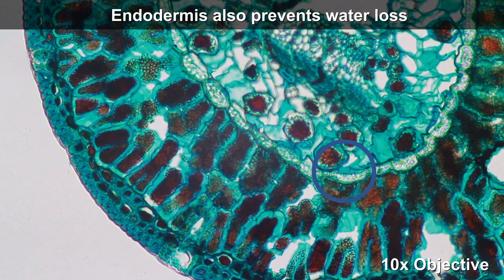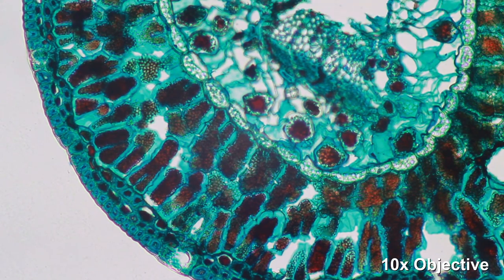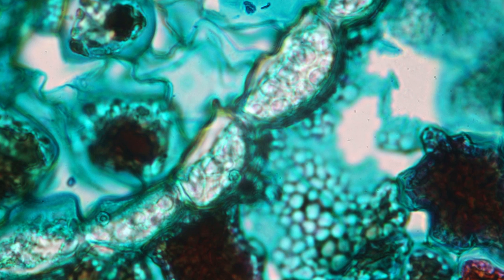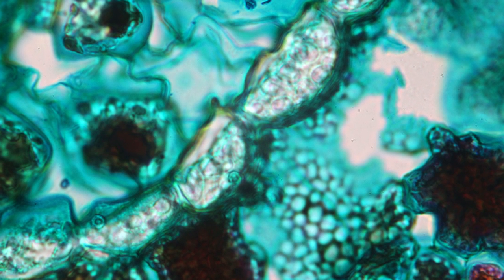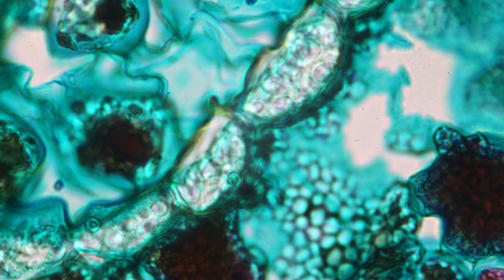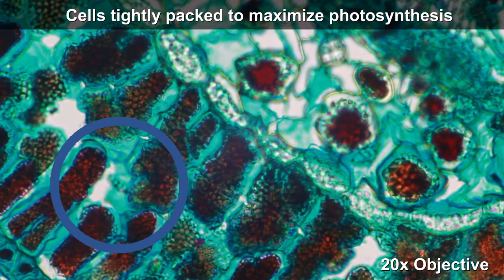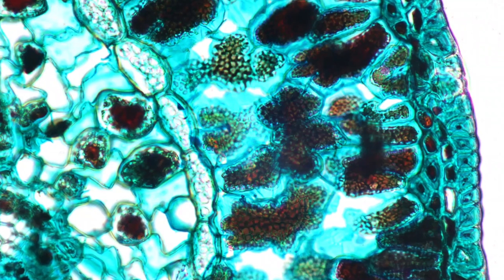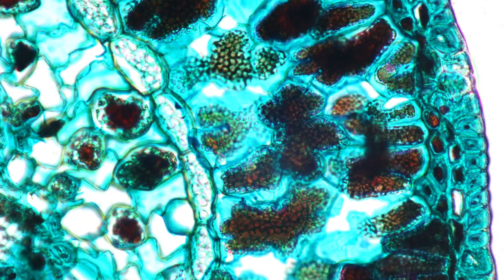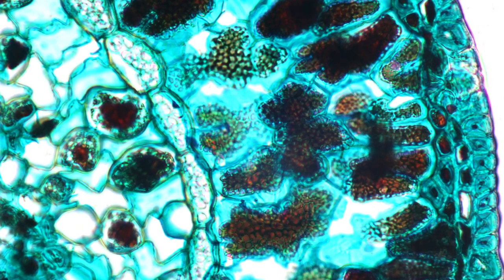We can see that the cells have a variety of different sizes and shapes. This here is the endodermis, which surrounds the central part of the leaf. The endodermis also protects from water loss, and there are also a whole bunch of other cells that do photosynthesis.